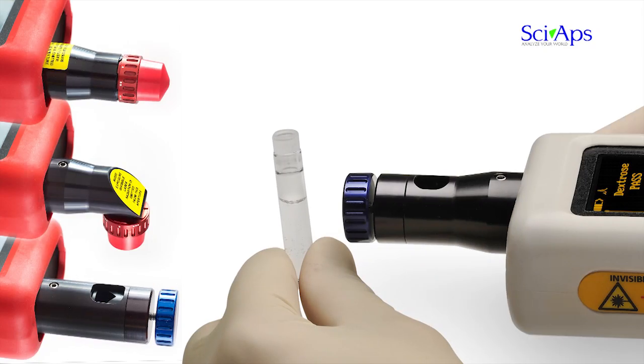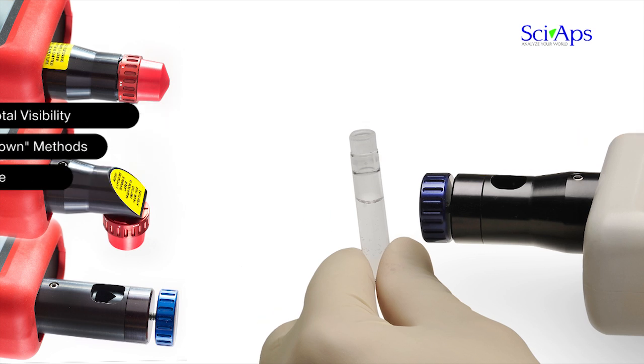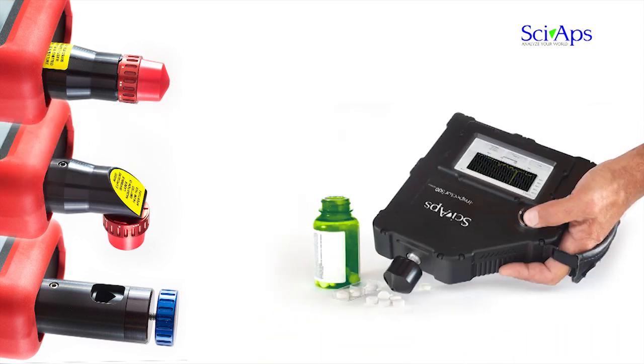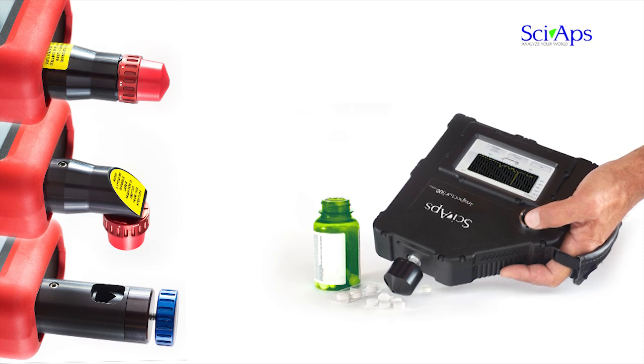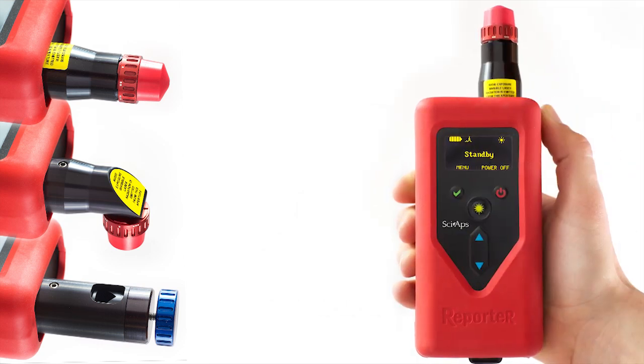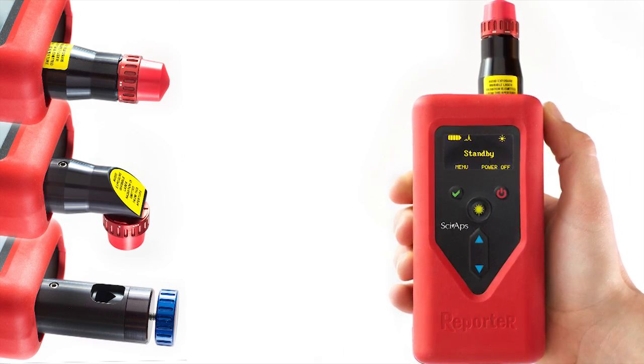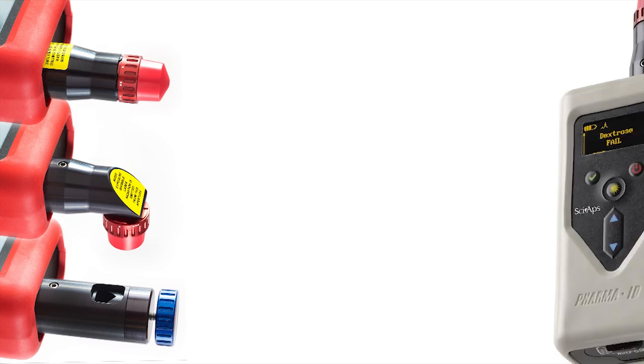Ever wonder why a specific sample was a pass or a fail? The CyApps Raman approach offers total visibility to the end user. The operator with the right credentials can set up the analysis model, set pass/fail criteria, and dig into why a specific sample was labeled a fail. Yet the analyzer is so easy to use — once things are configured, the method is locked down for tamper-proof decisions and data by any end user anywhere in the world.